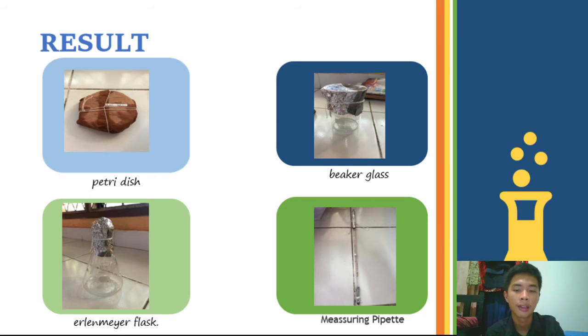And then you tie it with the yarn. We have to do that because its function is to prevent microorganisms from entering the tools to be sterilized.